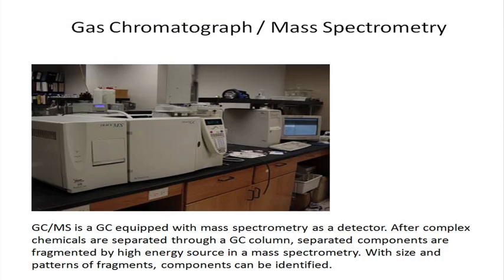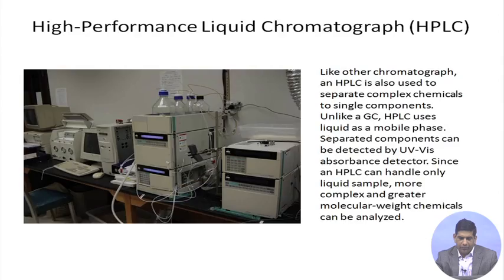So it helps you pinpoint what chemical it could potentially be, and then for that particular chemical you can go back and run it again on GCMS, or you can run it on GCFID, TCD based on what kind of chemical it is and what kind of detector is used for that. So that's the benefit of having a GCMS. It helps you in terms of the identification of the different components.